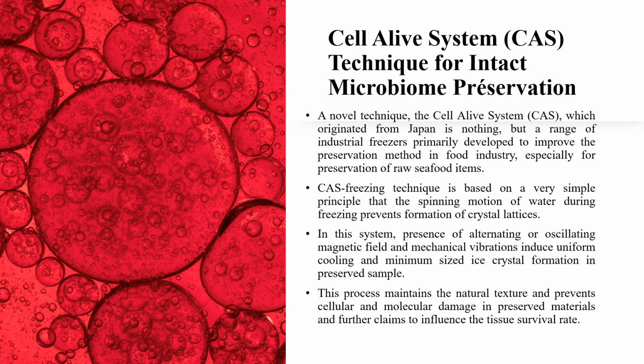This technique originated from Japan. It was developed for the food industry, especially for the preservation of raw seafood items. This technique is based on the freezing technique. The CAS freezer technique is based on a very simple principle: the spinning motion of water during freezing prevents the formation of ice lattice or ice crystals.